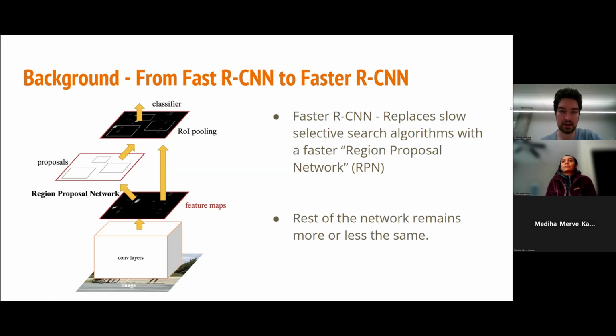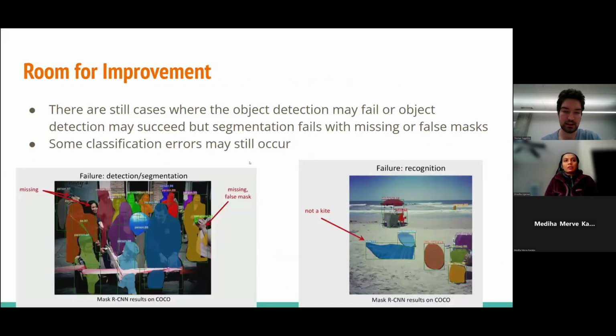Yeah, and I think it has proven, in terms of some of the general data, that it's good at picking up objects of the same classification but very different sizes. You can see the two purple people in this image are very different sizes, but it's still able to classify them both despite that. I imagine that's what generalizes to its pretty decent performance in the implementation for the radiation defects. It would be nice to know specifically what's going on beneath the surface. But I imagine it's doing the same thing other neural networks do, which is extracting features locally and then using that. I guess the classification at the end steps and the later layers are a bit different. You're not really classifying the image; you're saying this belongs to a distinct region.